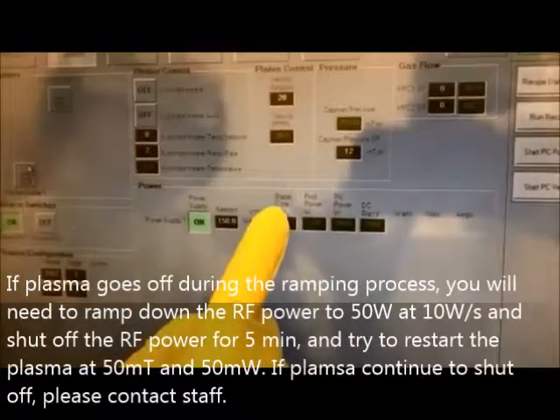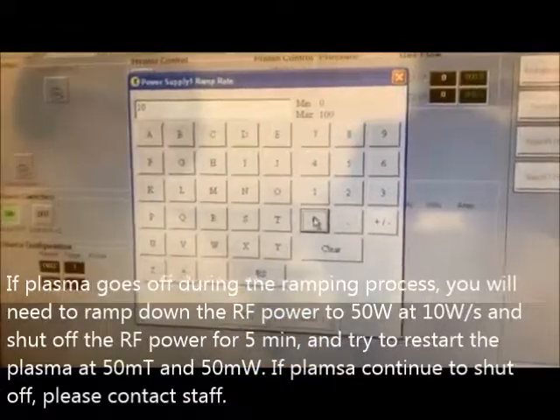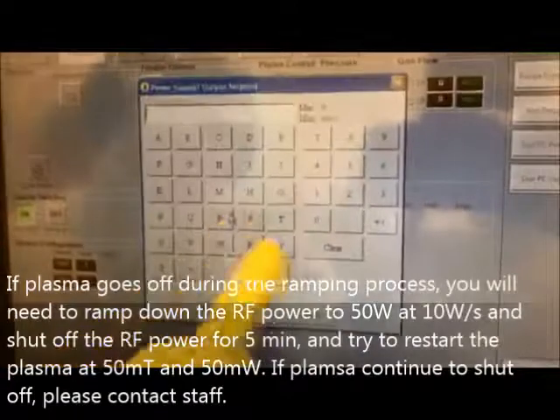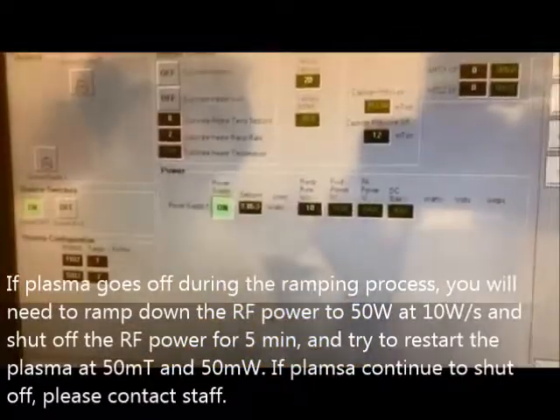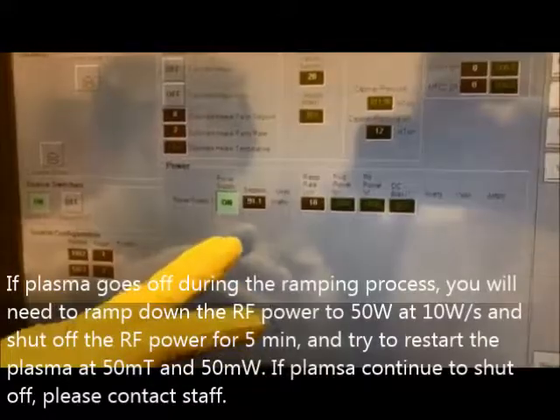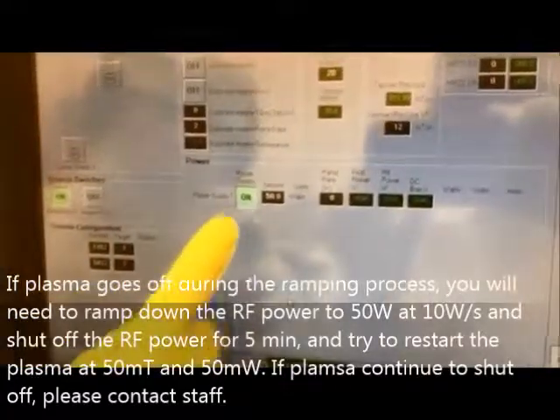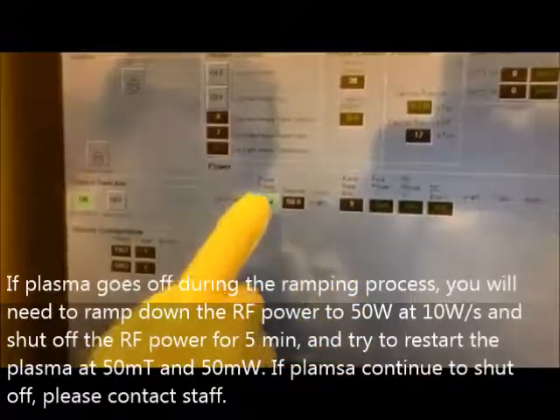So you will press the ramp, press 10. You can ramp down at 10 watts per second. And then once you set at 10, you are going to set this to 50. And then the power will gradually ramp down. And once the power ramps down to 50, you will have to turn off the power and basically restart again. So once the power goes back to 50, you turn it off.